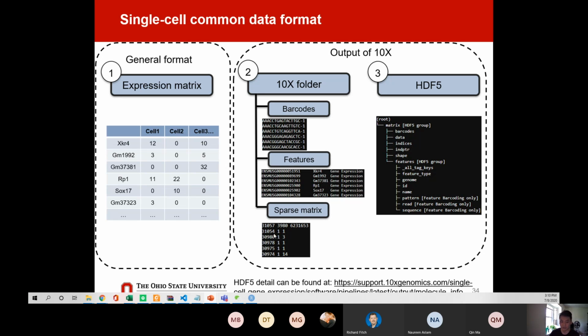It consists of 3 columns. Actually, it's like a coordinate system. Sorry, I should first introduce the header. The first value of the header is the number of rows in the matrix, so in this matrix we have 31,057 rows.